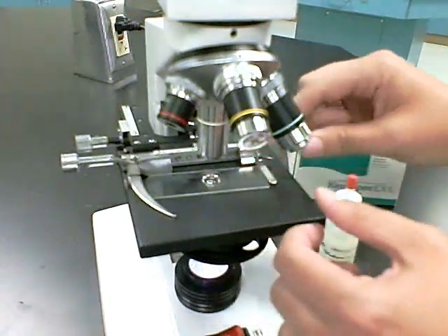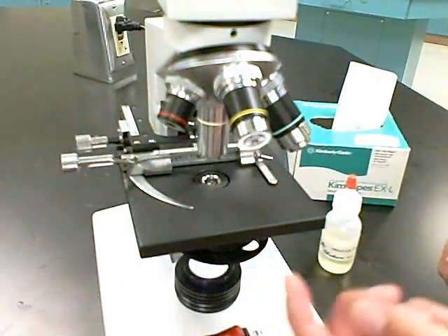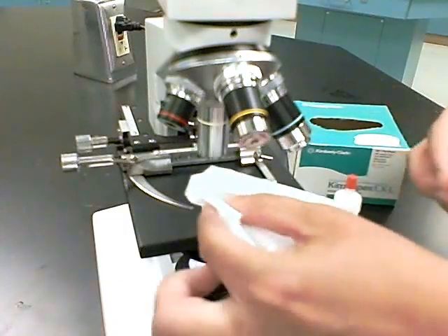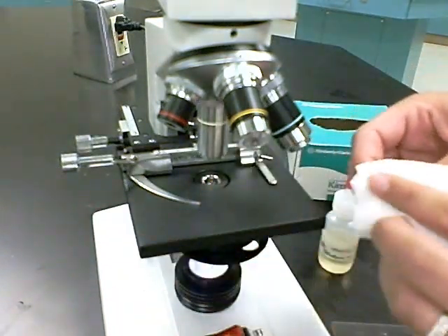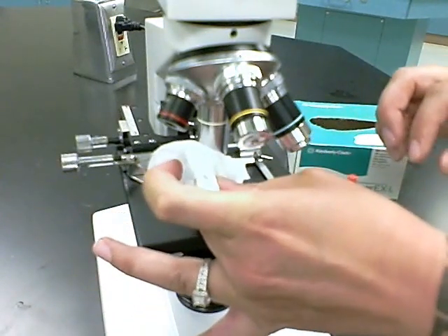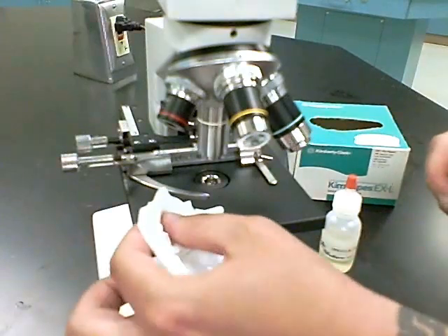Of course, you have oil here on your slide, which you can remove, and you also have some oil here on the lens. So what you do is you take a Kim wipe and just lightly wipe the lens. You don't want to scrub because that will actually scrape the lens. You just lightly wipe it, and of course, if you made any mess on the stage, you want to wipe that up as well.